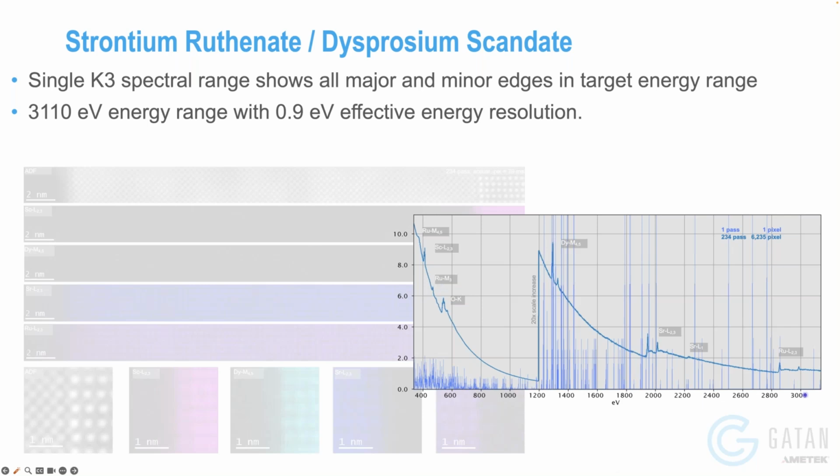But if you need to go at 9,000 spectra, then you kind of have to use the other camera. But definitely having both is wonderful, because you can do both experiments. Yeah, it's a really good question.